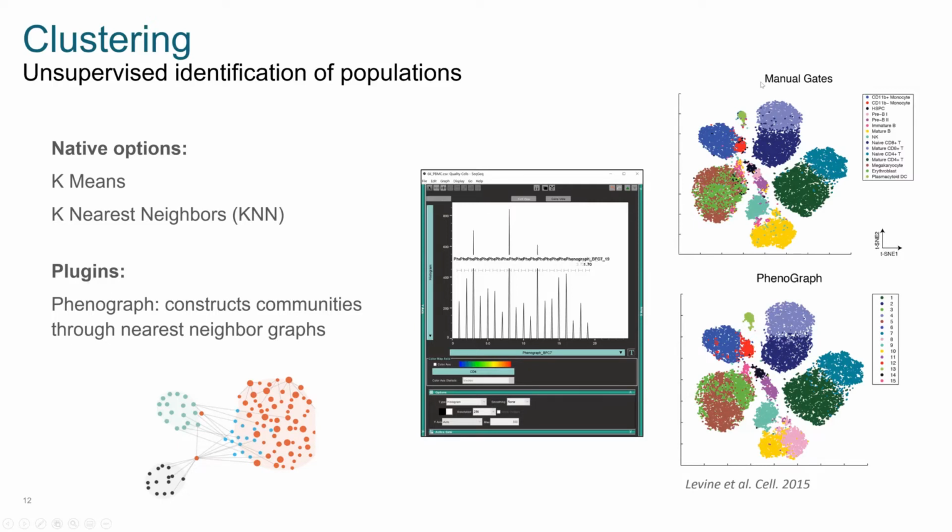Right, so here they've done a dimensionality reduction with a t-SNE, right? So they laid out all the data points so we can see it all up front in a bivariate plot. And they've taken their data and run it through Phenograph, right? And asked it to find populations completely unsupervised. And the software identified 15 different populations, color coded here on this low dimensional representation, or on this t-SNE space.